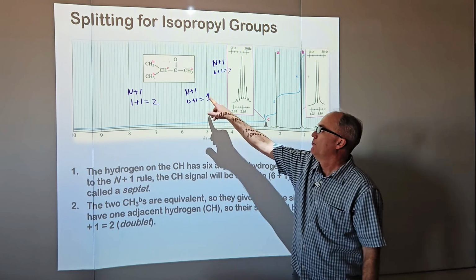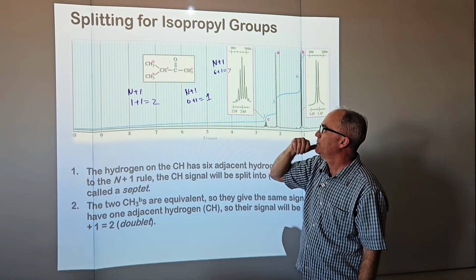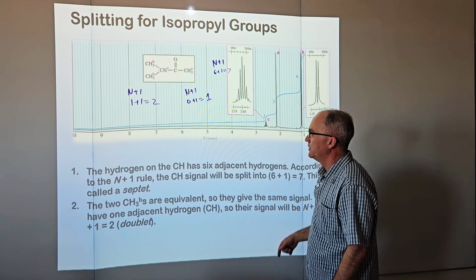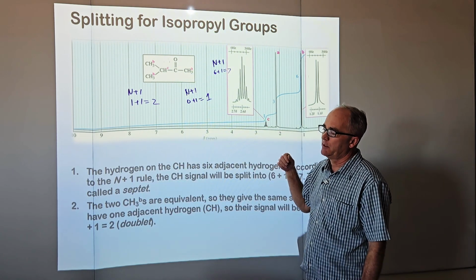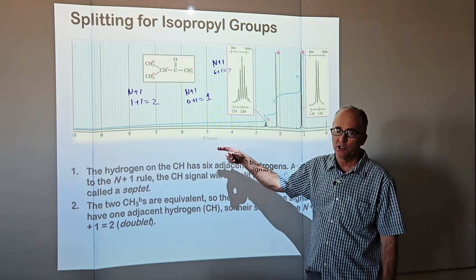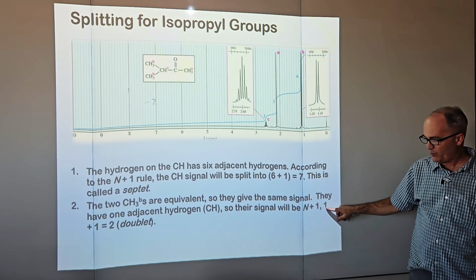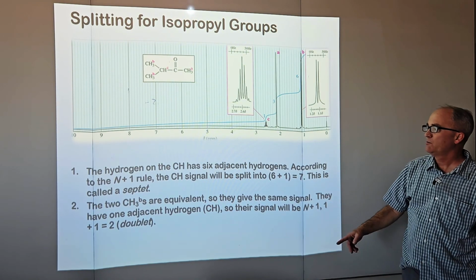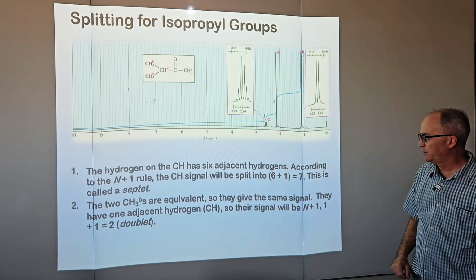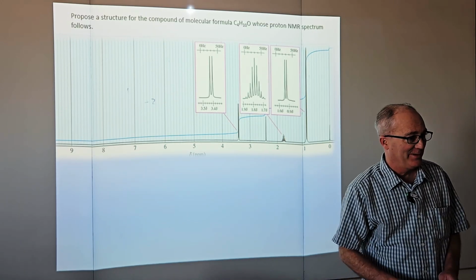So we had methyl hydrogens on an alkane furthest that way, and then we had a methylene where there was 2, and then the methine, and as we went from methyl to methylene to methine, things became more de-shielded and went downfield. So both these points make sense to us. The two methyl groups are equivalent. They give 1 signal. That's the doublet. 3 signals. Great stuff.